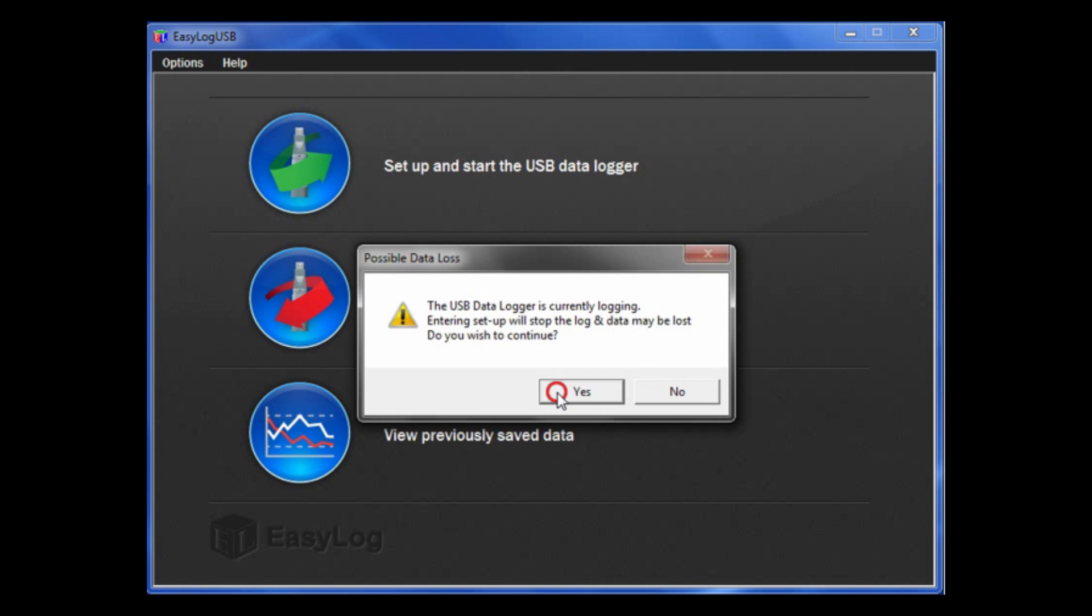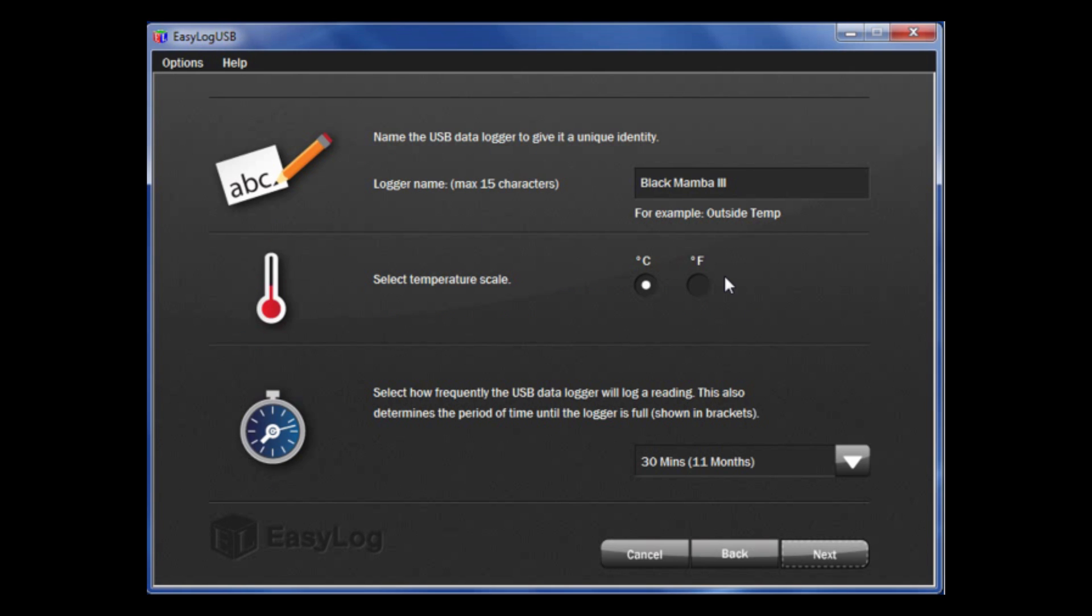You are presented with a number of options. First, you can give each data logger a unique name. This will help you identify individual loggers quickly.